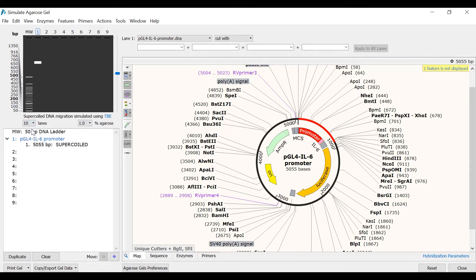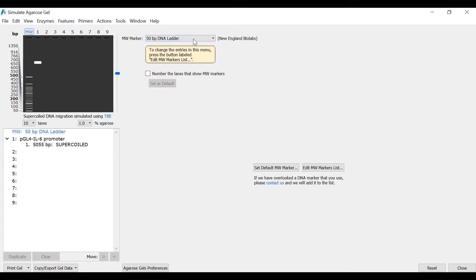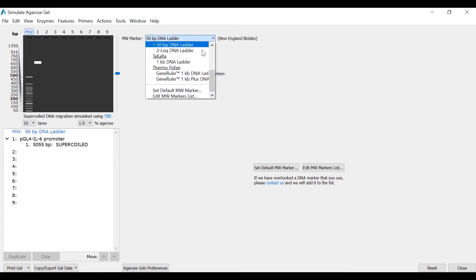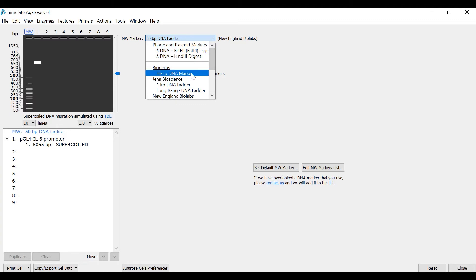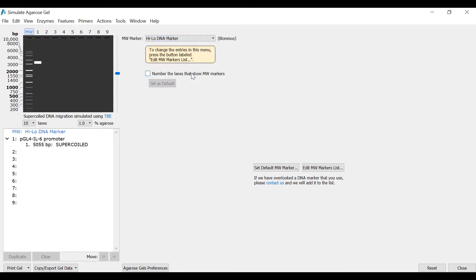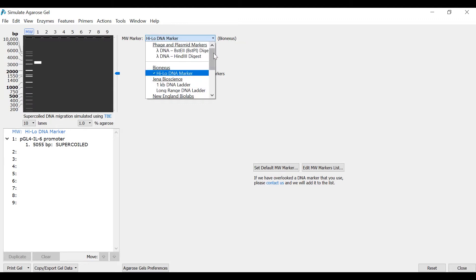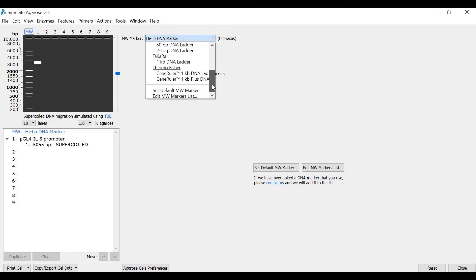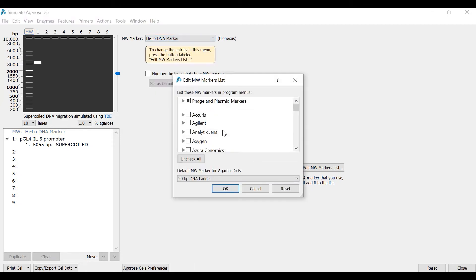In the first lane, labelled MW, this refers to a molecular weight marker, or DNA ladder. By selecting this in the list, I can specify a different marker by using the dropdown menu. If the marker you are interested in is not listed, you can select Edit Molecular Weight Markers List to browse additional markers.